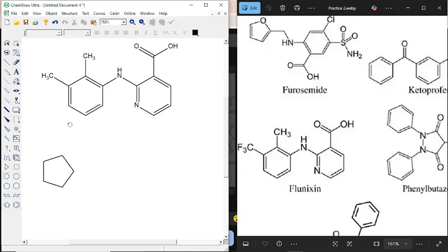How to rotate your structure? When you select the structure, there is this extending blue line. Once you take your cursor close to it, it will show this arrow. Here, you can now rotate by holding your left mouse button and turning. So you can do rotation depending on what you want.